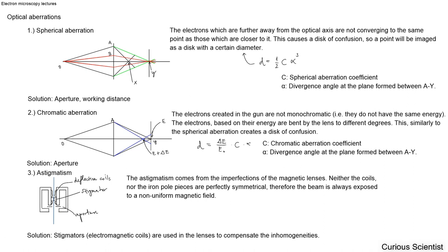So what kind of defects can occur on your images when you are using an electron microscope? There are basically three or four main defects or aberrations, and those are closely related to the structure of the microscope and also related to the working principles of the microscope. Let's discuss these four different things. The first one is the spherical aberration.